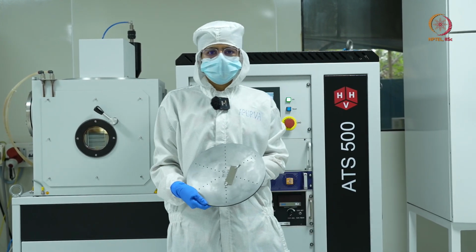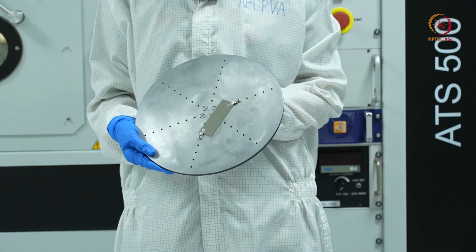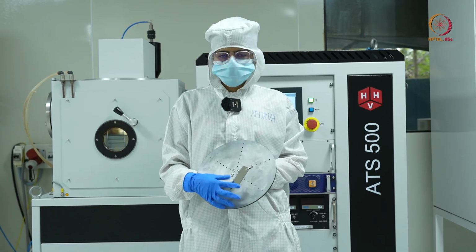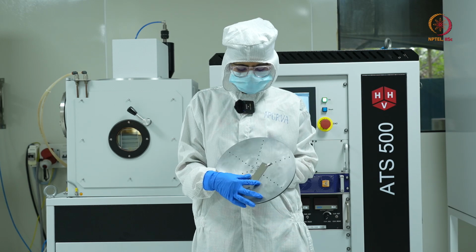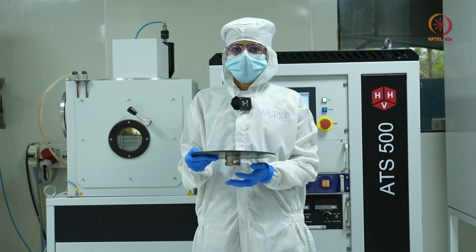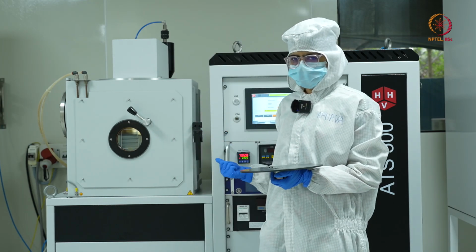As you can see, the glass slide which we had kept at the time of the vacuuming is nicely covered with tungsten. Initially the glass slide was transparent, and now it is shining and nicely coated with tungsten. Now I'll remove this glass slide and put the chamber back into vacuum.